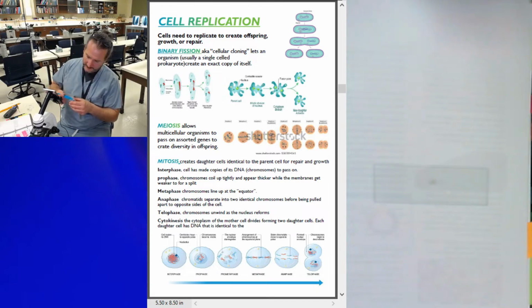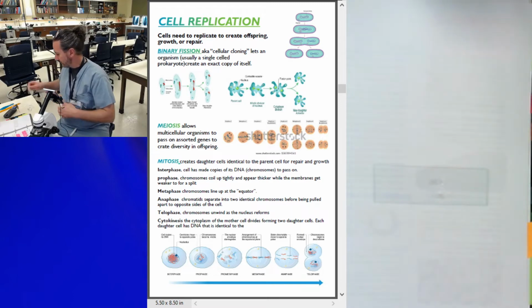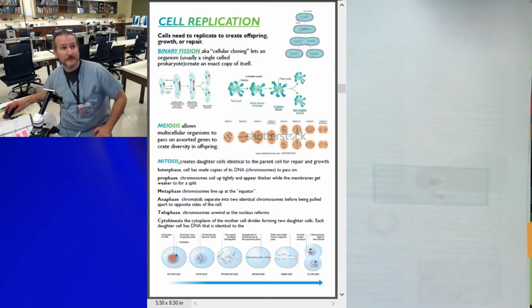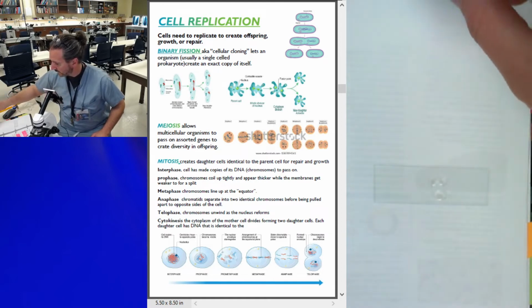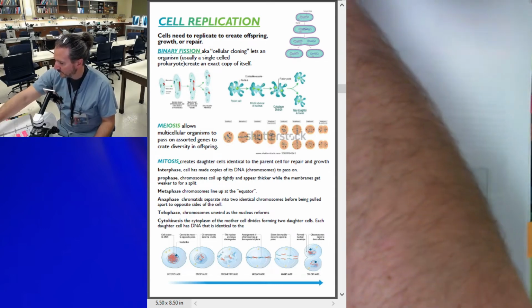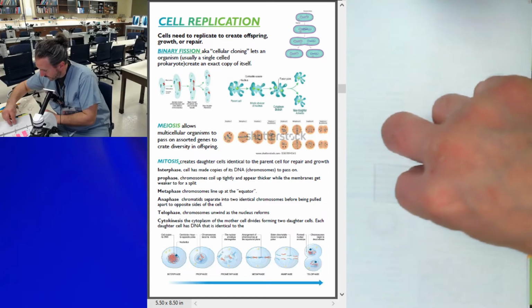The thinner they are, the better. Okay. I'm going to take a drop of water. Slide. Take my cover slip, at a 45 degree angle, drag it over. Drop.